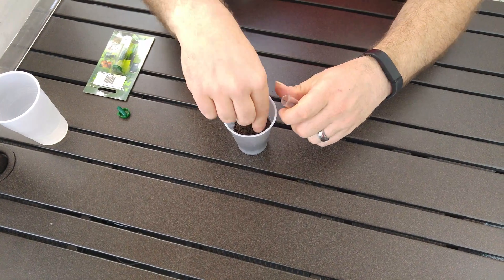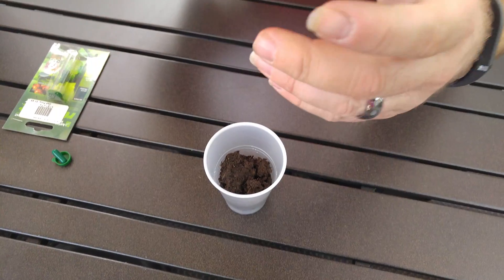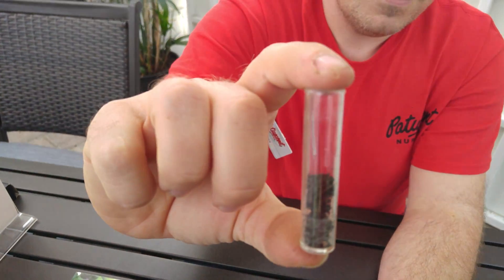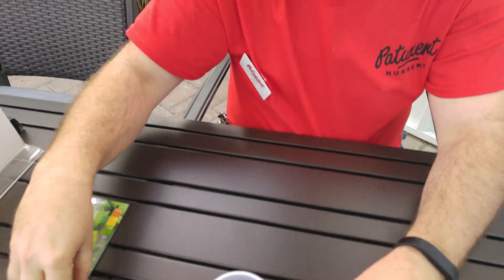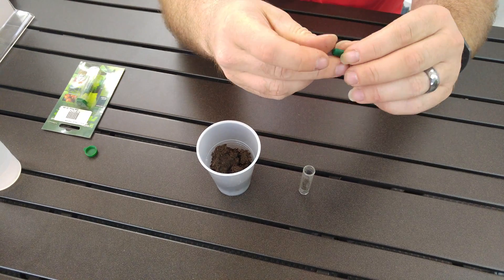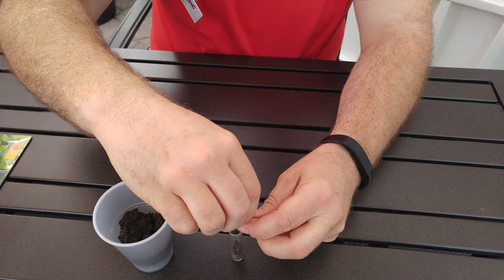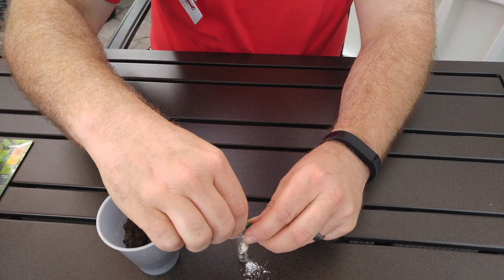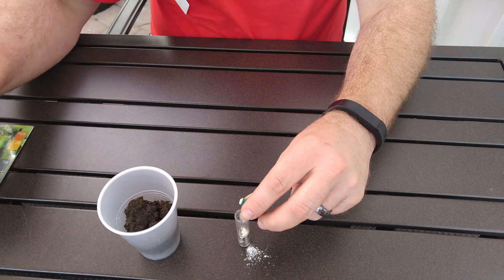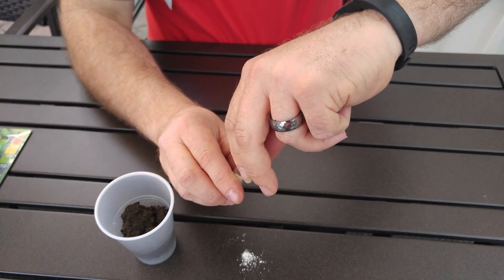We start with an empty vial and put a little bit of soil in here at a time, up to the first line. The next step is to empty the little green capsule into your vial. This is the powder that's actually going to test your soil's pH and it's water activated.